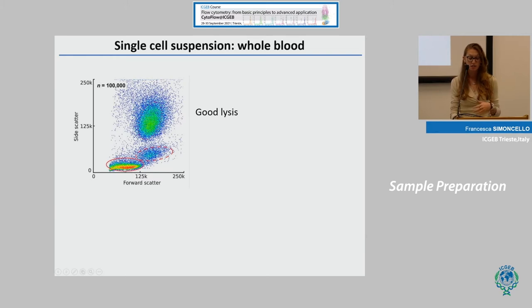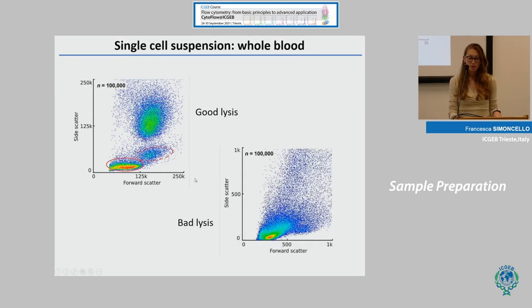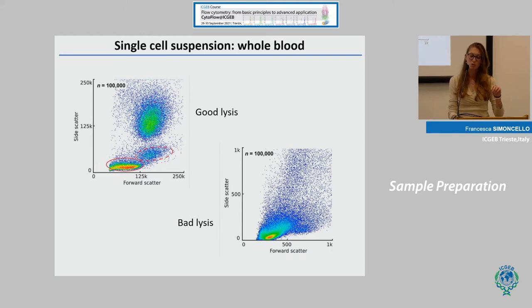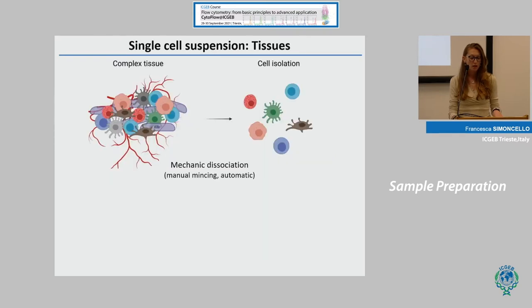You can find T-lymphocytes in the lower part, monocytes in the middle population, and granulocytes as the more complex population. However, when you don't perform a good lysis of red cells, this distinction is no longer possible. Another consideration: when you are not able to physically remove red cells, you can label your sample with CD45 antibodies and exclude red cells during analysis, because red cells are negative for CD45.